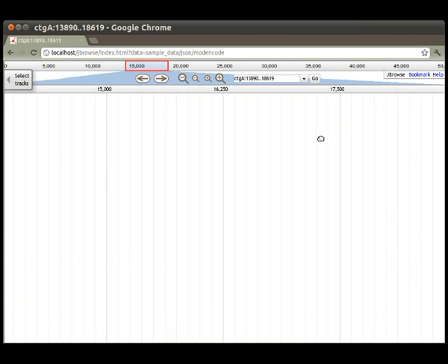This concludes the overview of JBrowse's main features. Visit jbrowse.org for more screencasts, as well as live demos and links to documentation about how to set up your own JBrowse genome browser. Happy browsing!